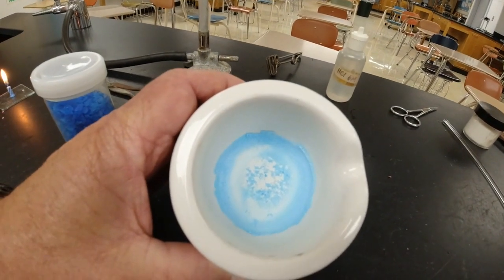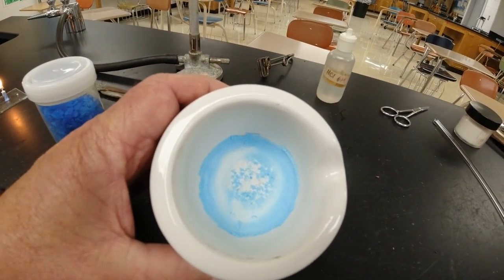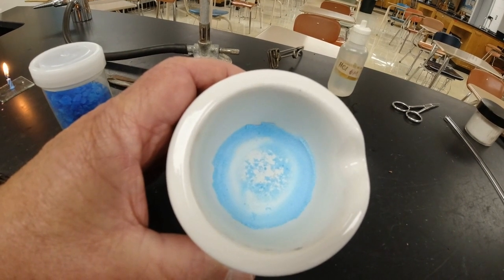Well, if we kept grinding this up, it would probably never get rid of all the blue color, but it would become less and less of a blue color.